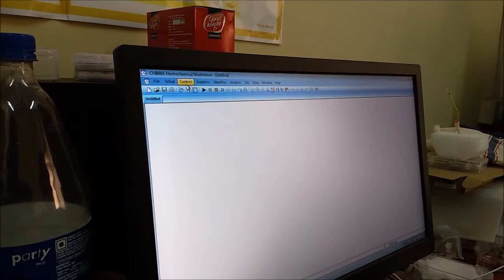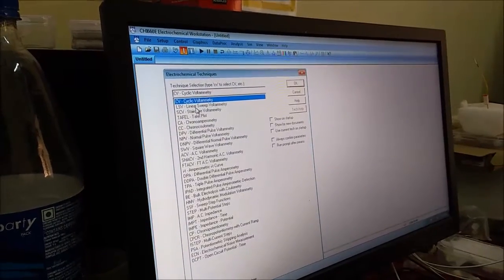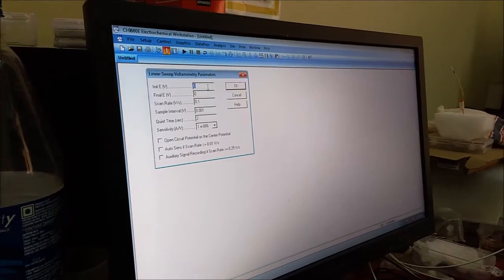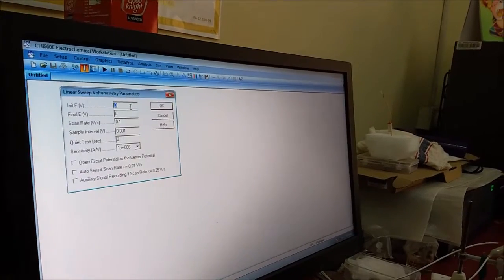Now I have to click on Techniques, then I will perform first the LSV — Linear Sweep Voltammetry. Lithium is a positive ion, so I have to scan for a negative voltage.